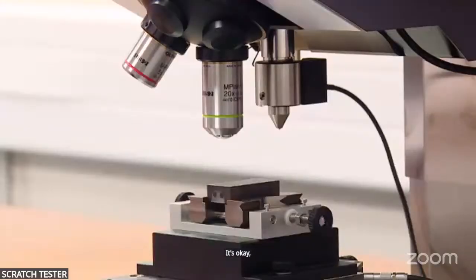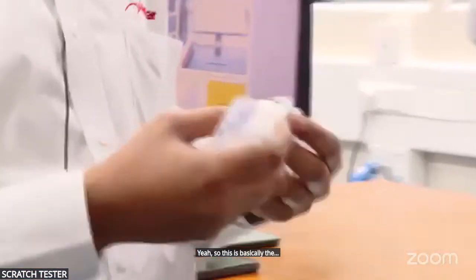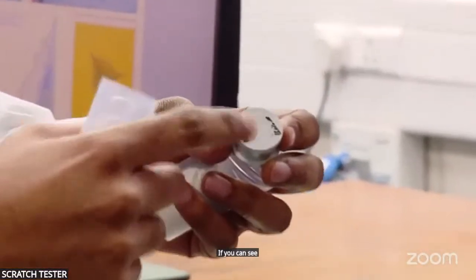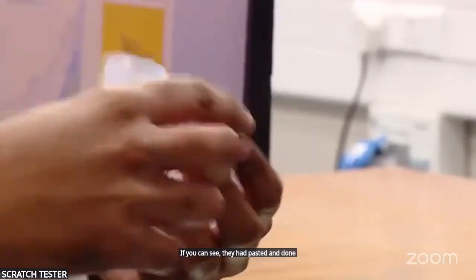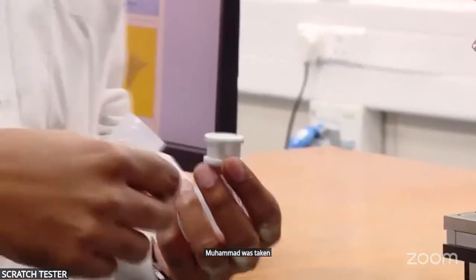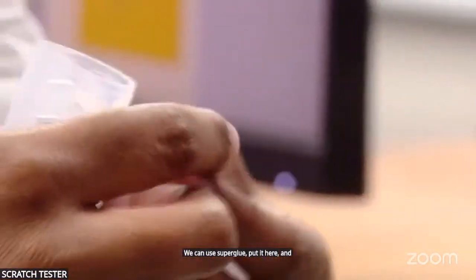Yeah, it's okay. So this is basically the aluminium sample holder. I think you can see they pasted and did some measurement on it. So if you have something, you can use super glue, put it here and do the scratch using that.